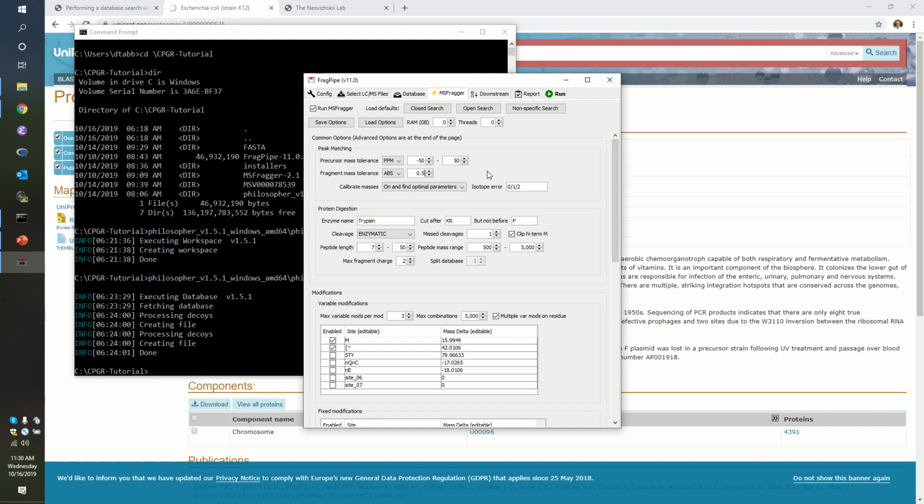So I'm going to explain that we have a mixture of high-resolution MS scans and low-resolution tandem MS scans in this file. This type of data collection was really, really common, well, in 2008 and 2009. It's not so frequently what you see done today. A lot more people today use HCD than was true back then. So if you're working with a data set that's got some history on it, like this one, you're probably going to need to allow for the fact that it has much more accurate measurements of precursor ions, of peptides, than it does of fragment ions, which here are, each fragment ion is only known to be accurate within 0.5 M/Z. It was measured in an ion trap.